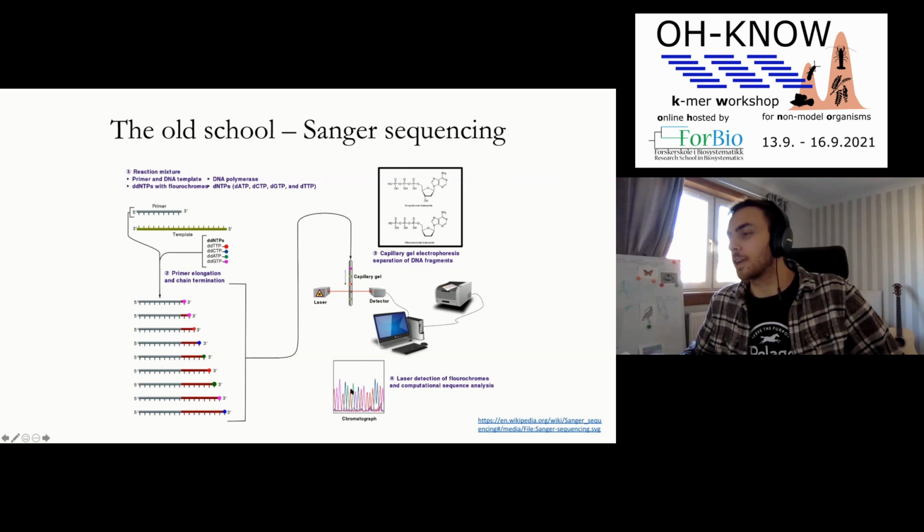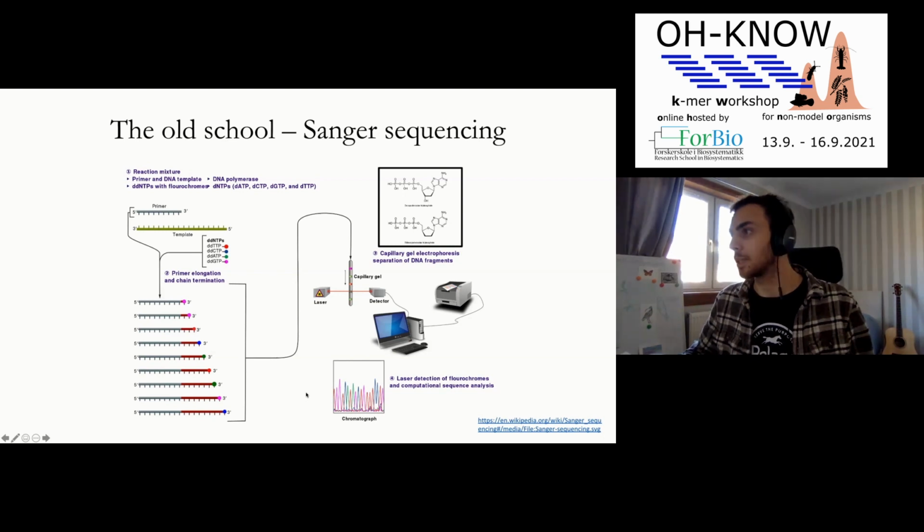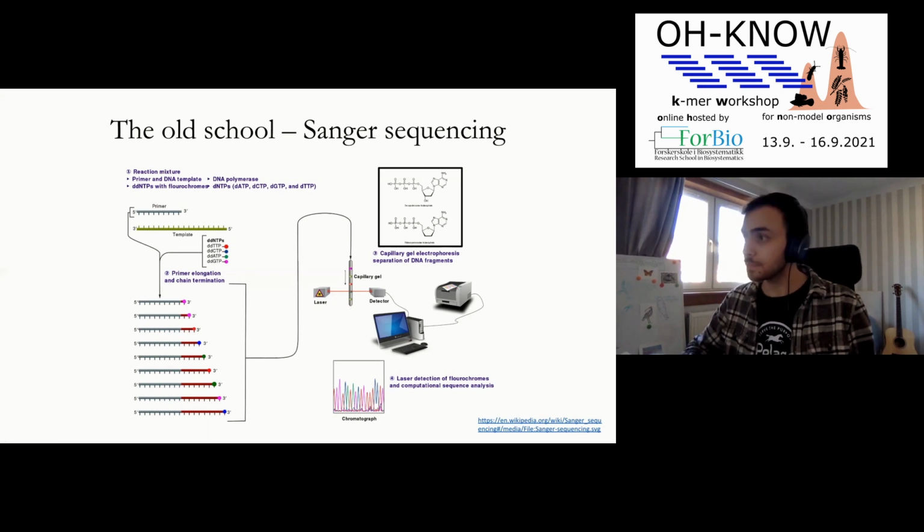Although Sanger was a very powerful technology at the time, one of the challenges was you'd often get failed runs, and you would constantly have to rerun plates and plates of samples. So that was a very painful thing, and complex samples with more inhibitors and things like that can also suffer quite badly if this reaction doesn't work as well as you hope.